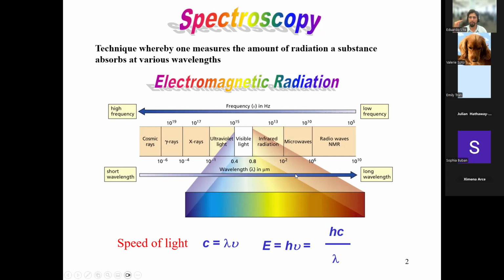But in short, for spectroscopy, we take a source of photons, and it could be UV, infrared, radio waves, or X-rays. We use all sorts of energies in science. We shine it at a piece of matter, and the matter interacts with it somehow. Then it re-emits it either in the same region or in a different region, and then we measure it. We can graph that measurement, and it gives us information about the compound.